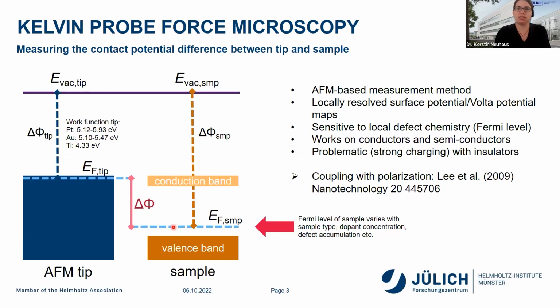So we can sort of see the oxygen vacancy concentration of the sample surface.